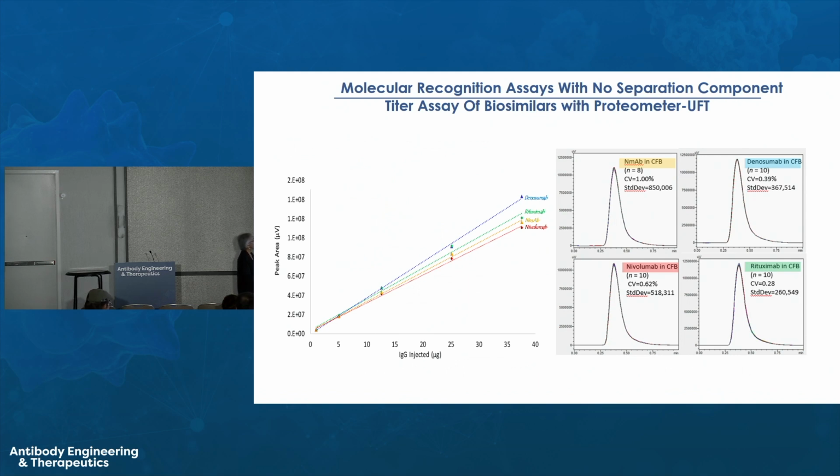And we formulated all the IgG1, IgG4, IgG2, and NIST-mAb, biosimilars, straight line for all of them. Very good reproducibility.